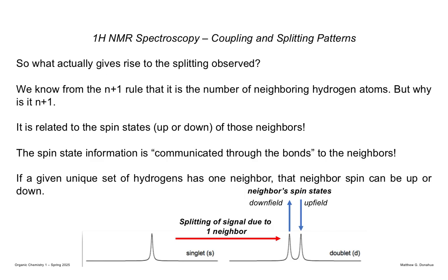So let's look at the situation where you're doing the uniqueness test just visually based on a structure, and you're saying, okay, there should be 3 unique sets. To a first approximation, they should all be singlets because you're just assigning, okay, it's a set. But now, due to the neighboring spin states, you have to do that second approximation.